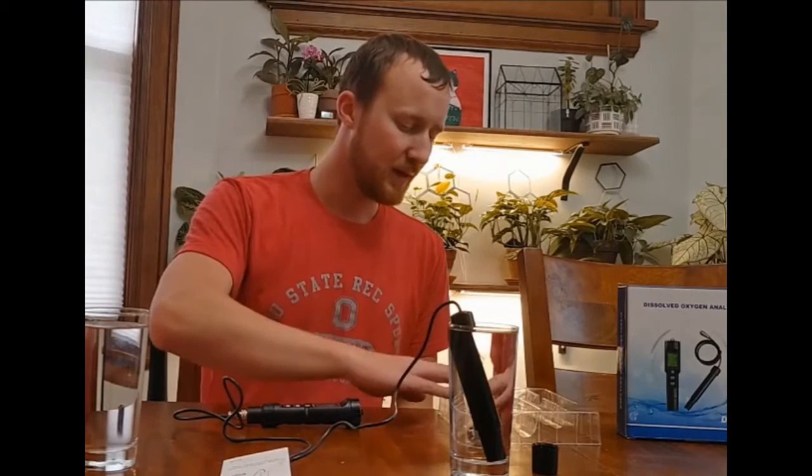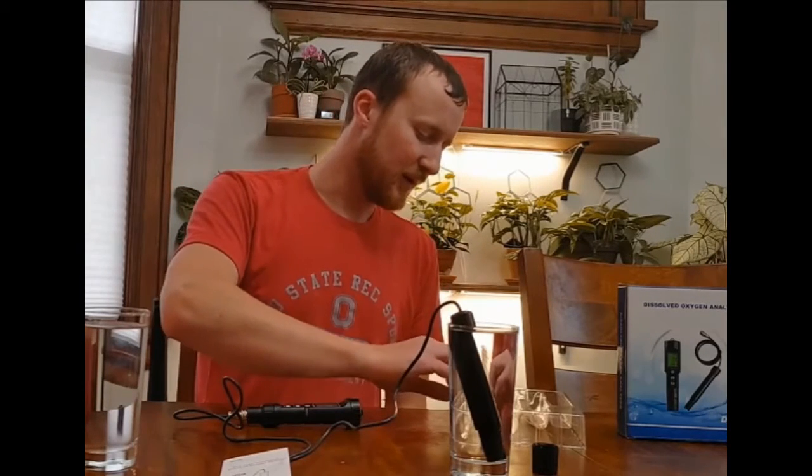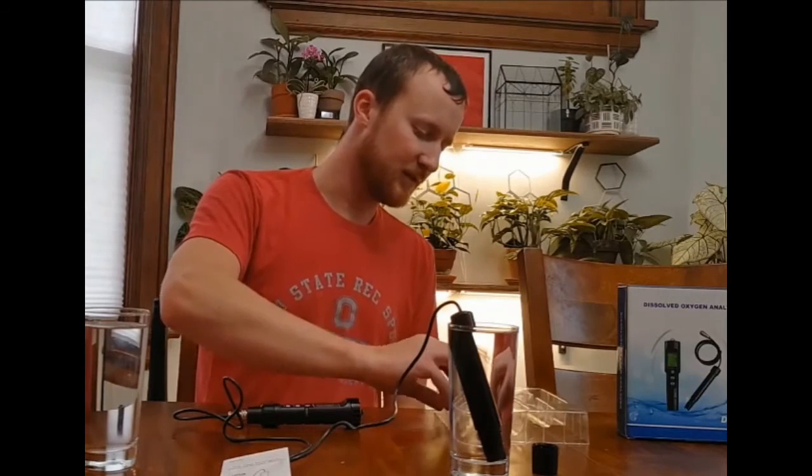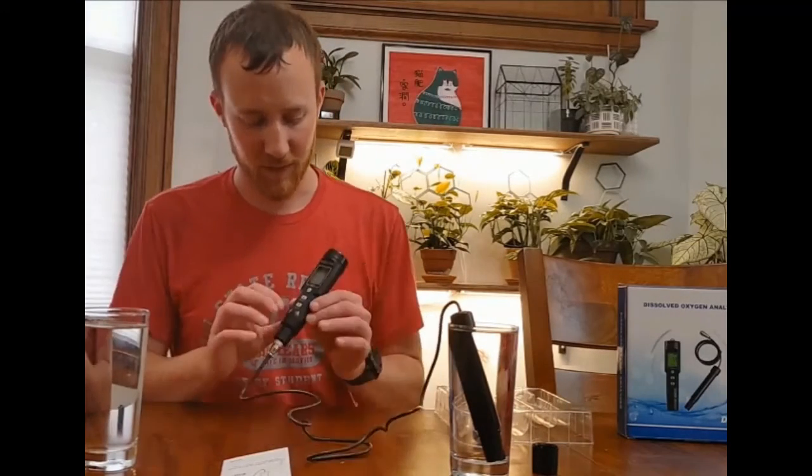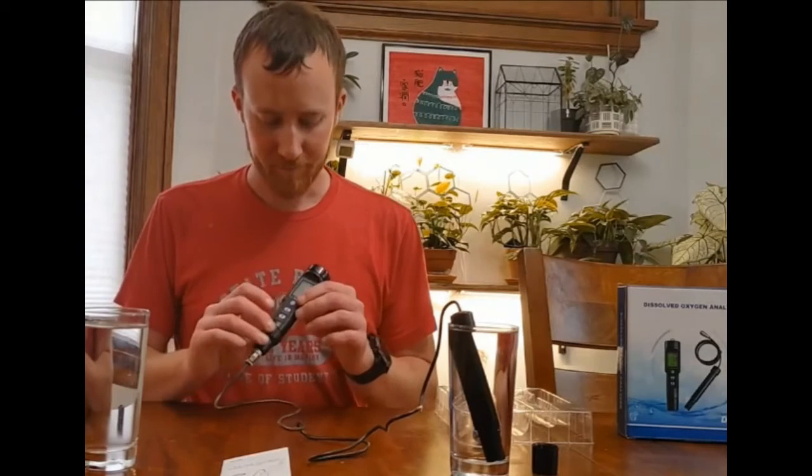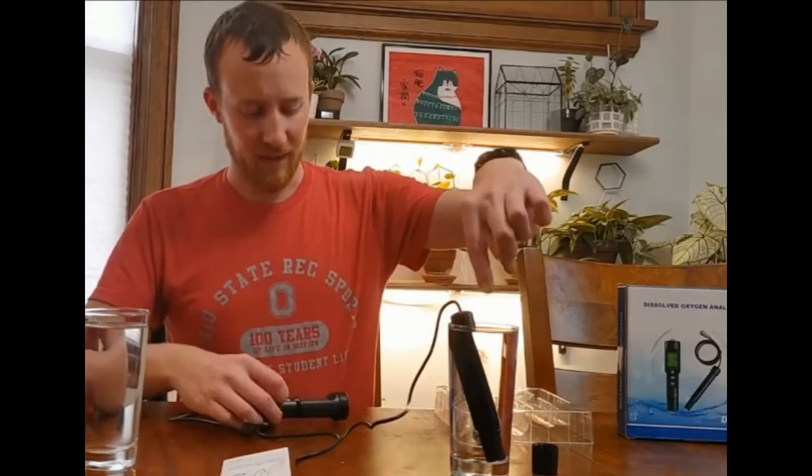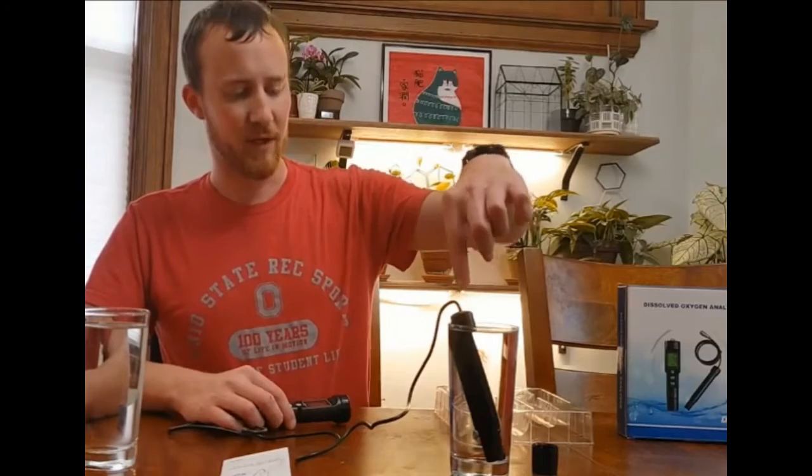I would guess that you can order more of these for this pen. It seems pretty well made. It does say DO9100 electrolyte solution on it, so I assume it's specific to this pen. Make sure to order the right one here.